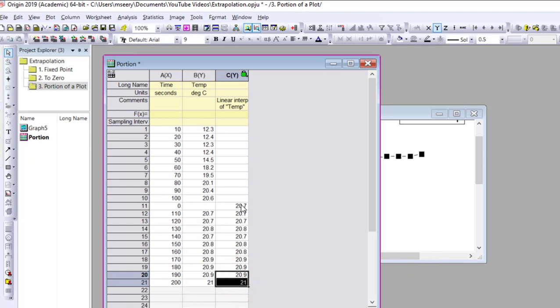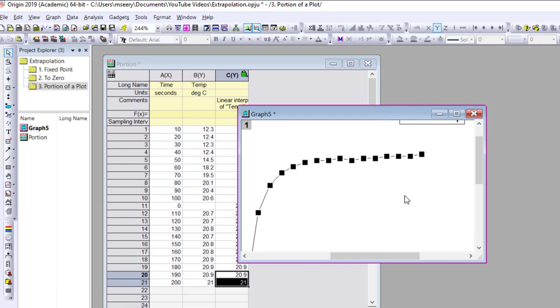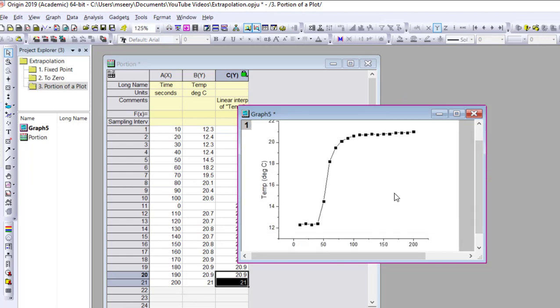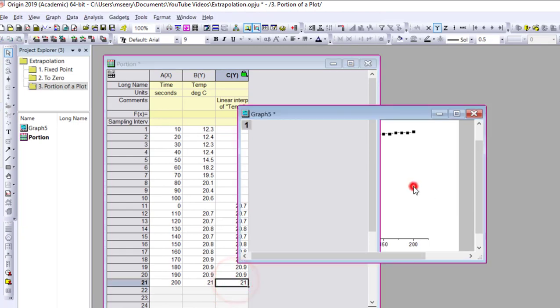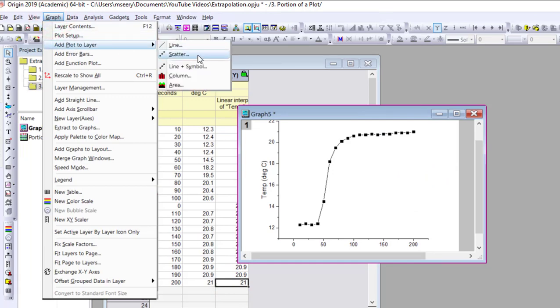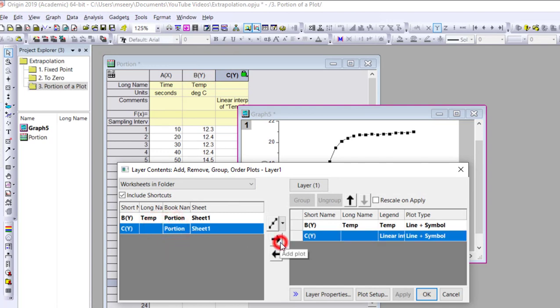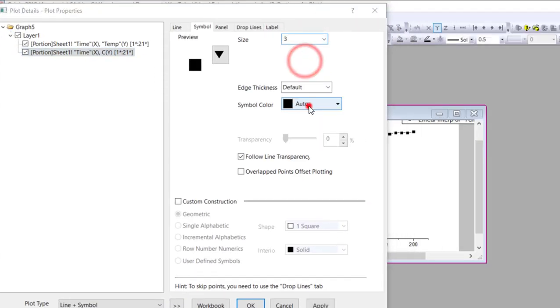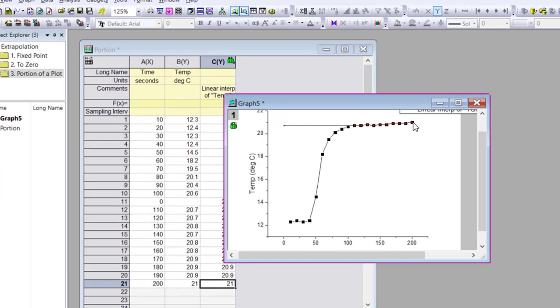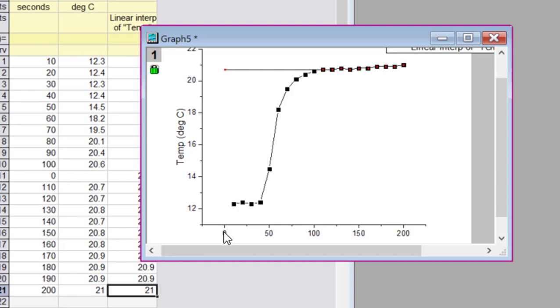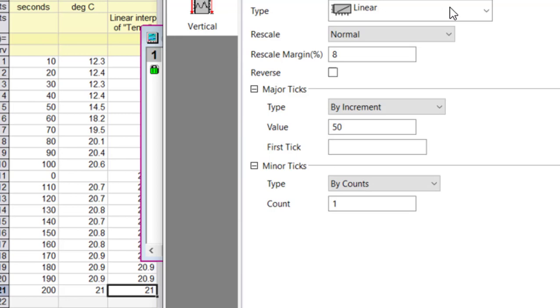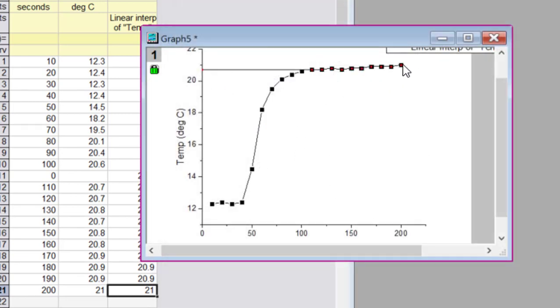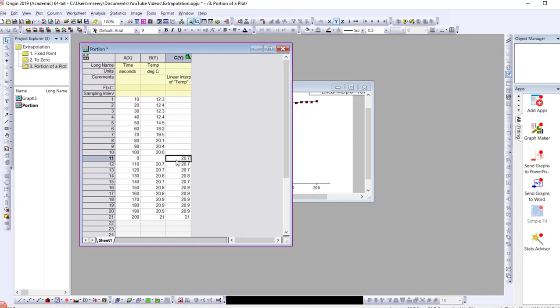Pressing OK, we can see it's extrapolating back to about 20.7 degrees — essentially taking the last two points and extrapolating backwards using linear. To visualize this, go to Graph > Add Plot to Layer > Line and Symbol, and add the new column C to the existing plot. The line extends back, and changing the scale to start at zero shows this extra extrapolated point clearly at zero time, giving us 20.7 degrees as our extrapolated temperature.